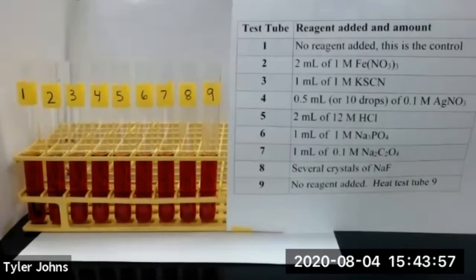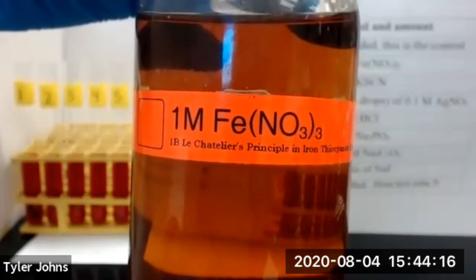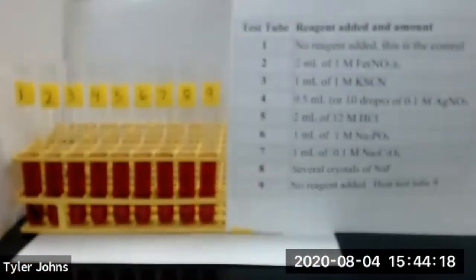The darkest test tube will have the highest concentration of Iron Thiocyanate Complex. We'll start by adding two milliliters of our one molar Iron 3 Nitrate to test tube number two.